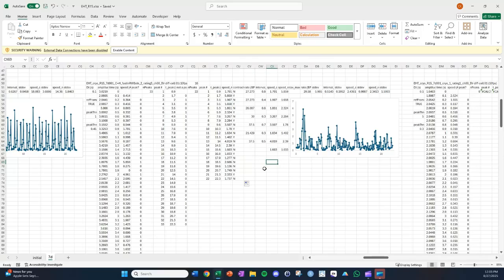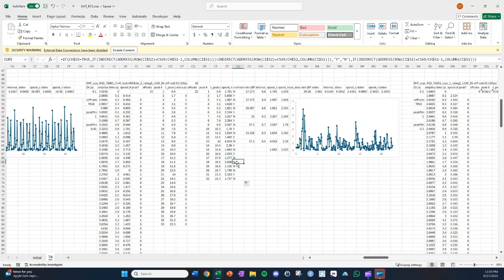So I already manually identified most of these as either peaks or not peaks, corresponding with what I see on the graph. And it looks like I left off somewhere around 16.8 seconds. So that's probably this. That's that peak here. And then the next ones aren't making that much sense. It's contraction fall or relaxation followed by relaxation peak.